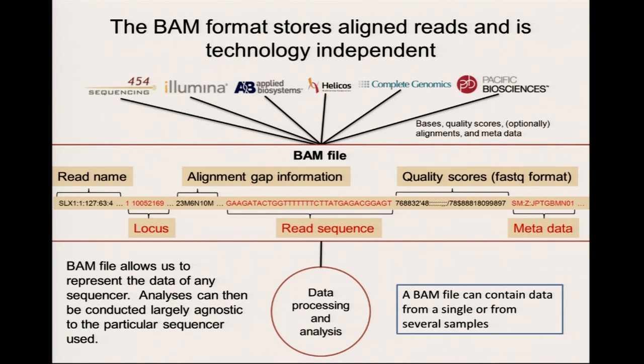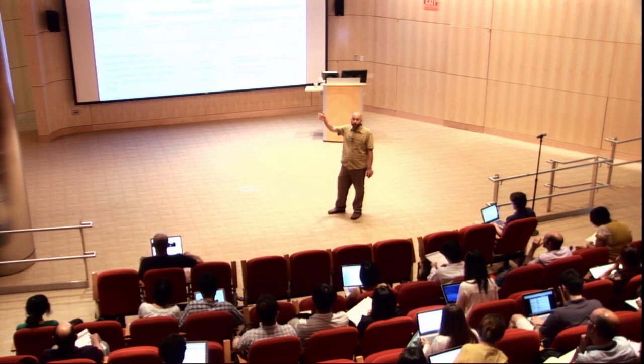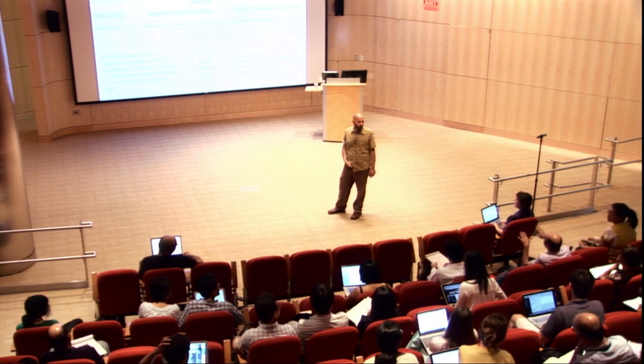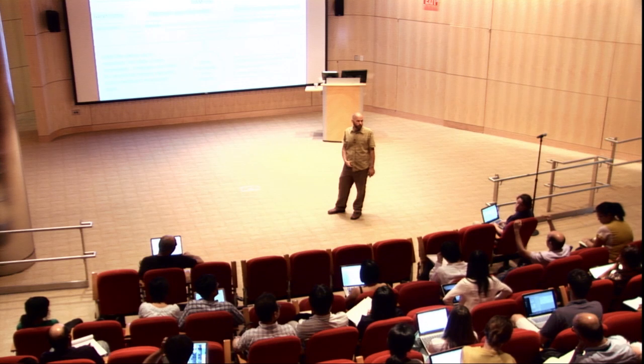That's a good question. I think what happens is in the FASTQ file, they're going to be assigned the same identifier, so you know that they came from the same fragment. It's a fragment identifier. And then in here, there's data that says I'm a paired read, and my mate's pair has this name. So they're associated with each other in the file. In this metadata, there's tons of stuff to tell you where your mate is, where your buddy is. For the FASTQ, usually if it's pairs, then it's two different FASTQs that are just matched. Like the first one here is the matching case.